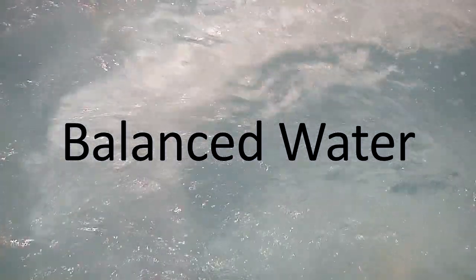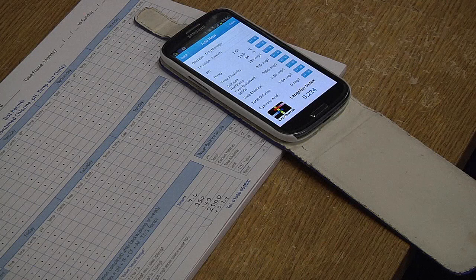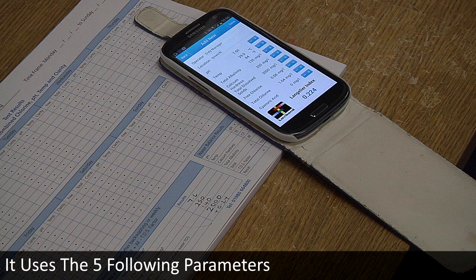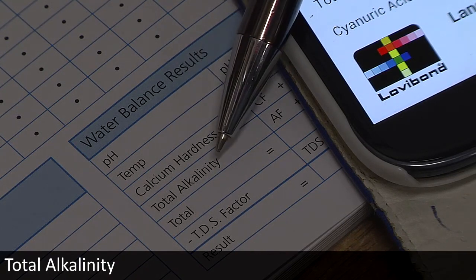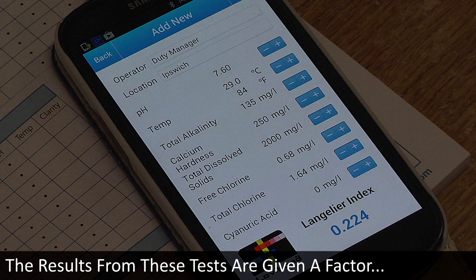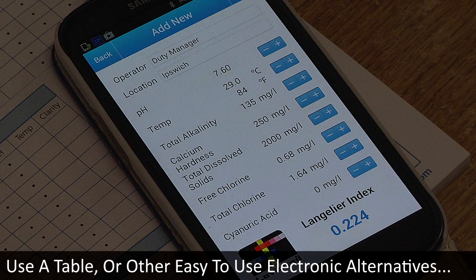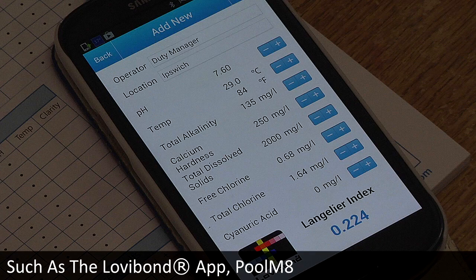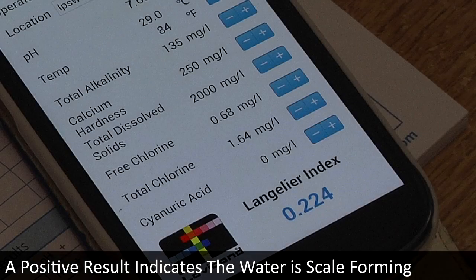Balanced water, sometimes referred to as the Langelier Index, is a formula to determine whether pool water is in balance, is scale-forming, or is corrosive. It uses five parameters: pH, temperature, calcium hardness, total alkalinity, and total dissolved solids. The results from these tests are given a factor, which is used in the formula to calculate water balance. The formula can be calculated using a table or easy-to-use electronic alternatives. A negative result indicates the water is corrosive; a positive result indicates the water is scale-forming.